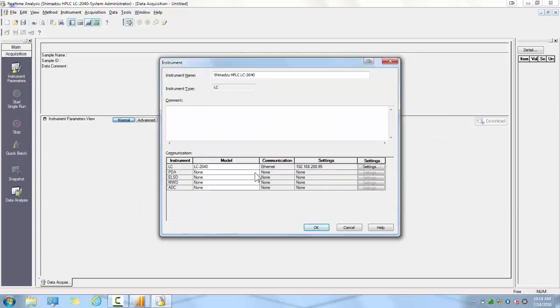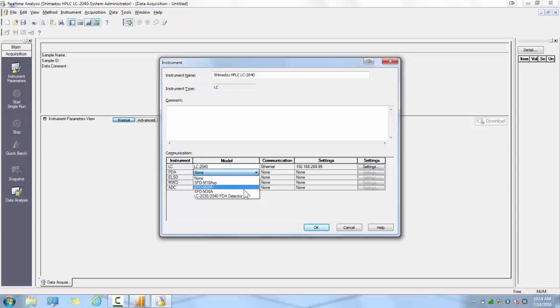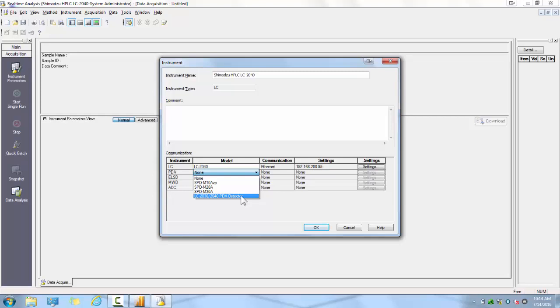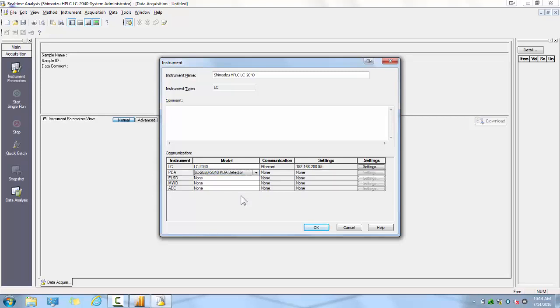If you have a photodiode array detector, you will then select which model you have from the drop-down menu. If it is a modular PDA, such as an SPD-M20A or an M30A, you will need to click on the Settings and select the PDA from the list, just as we did with the LC system. In the case of this example, the PDA is integrated into the i-Series, so we need to select the LC-2030-2040 PDA detector without specifying any additional IP settings.